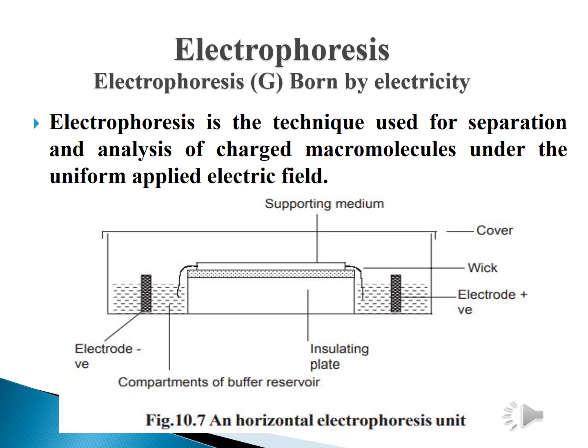So the compound to be separated is placed into the medium, and when the electric field is applied, based on the potential difference and flow of current, the particles will move towards the oppositely charged electrodes. For example, if the separating particle is cationic, it will migrate towards the cathode. Similarly, if the particle is anionic, it will migrate towards the anode. Simply, cations move towards the cathode and anions move towards the anode during electrophoresis.